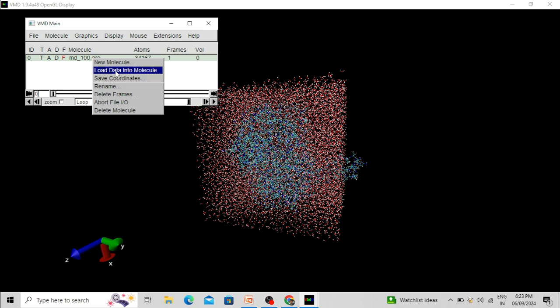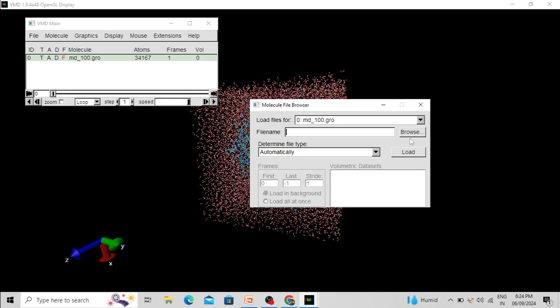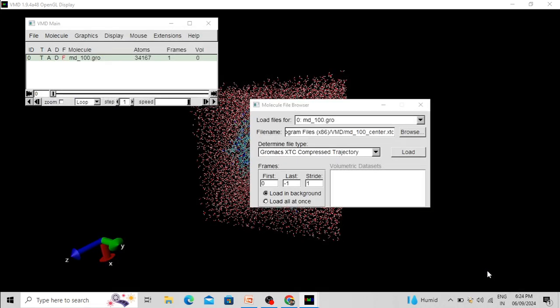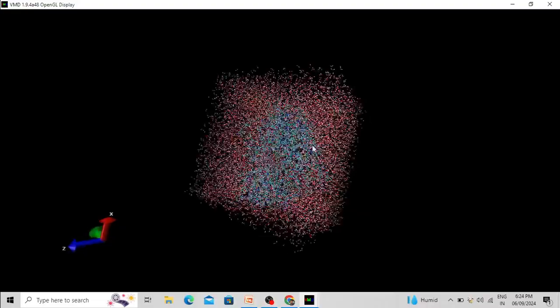Click on Load Data Into Molecule — the structure is already loaded and we have to load the trajectory into it. Browse and choose the trajectory file, then click Open and Load. Now you can see the molecules are moving.